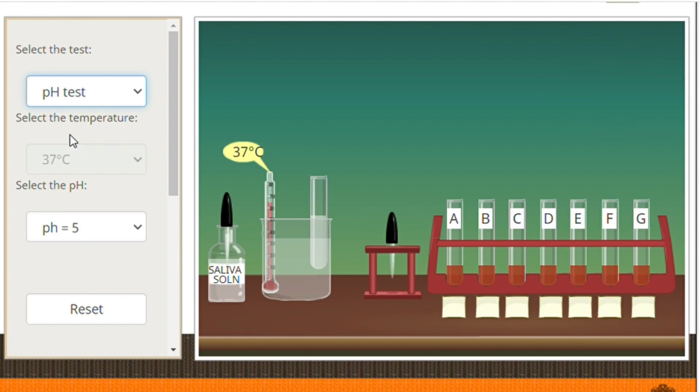For the pH test, each starch-sodium chloride mixture is maintained at pH 5, 6.8, and 8. The steps for this part of the experiment will be the same as the steps we did on the effects of temperature. You will also take note of the color changes in the series of test tubes for each given pH, and do not forget to record your observations.